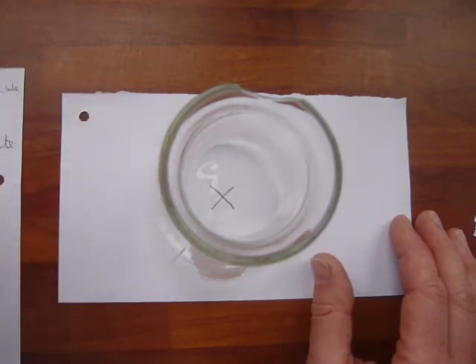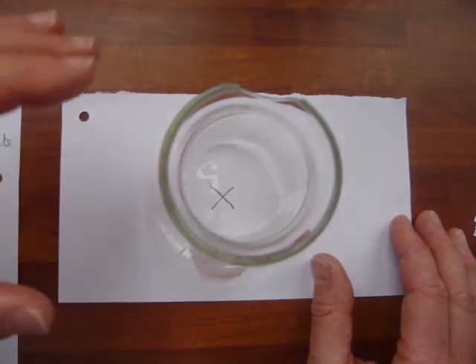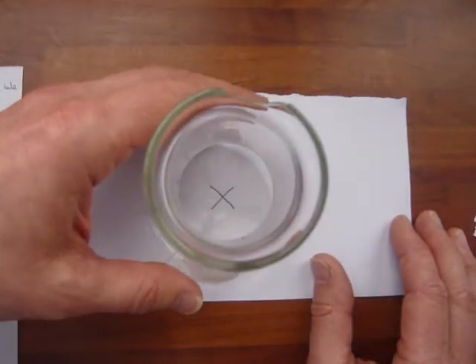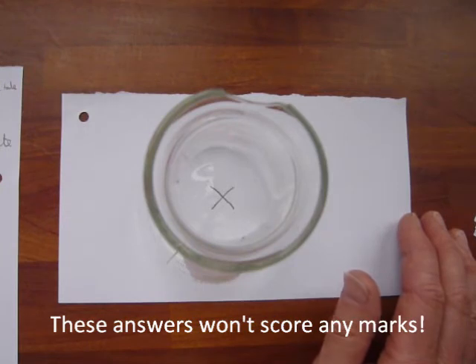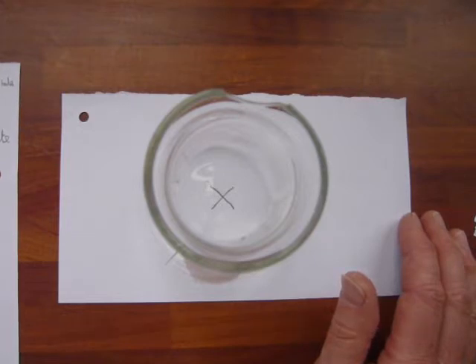Other bits of apparatus, you can forget about them. I often read answers from pupils where they say, to make it a fair test, I must use the same test tube, I must use the same thermometer, I must use the same measuring cylinder. Those things are all really quite trivial, and they're not going to affect your reaction.